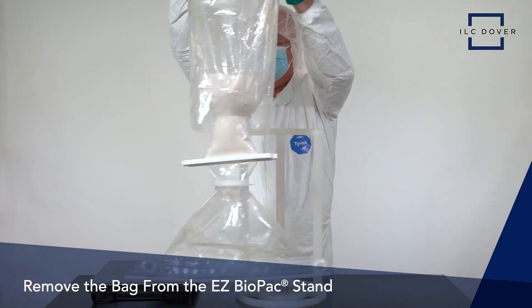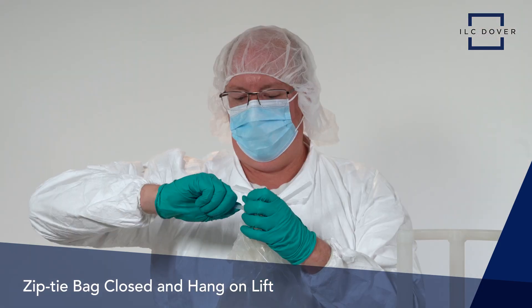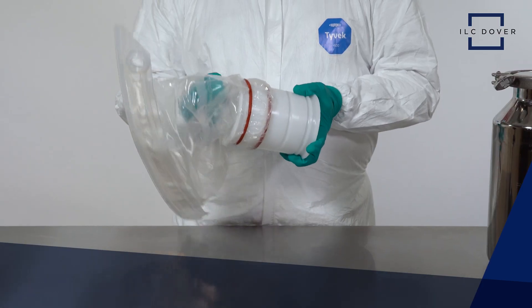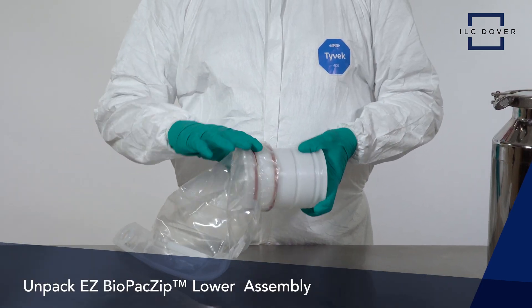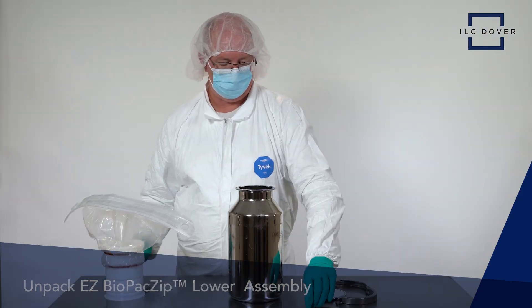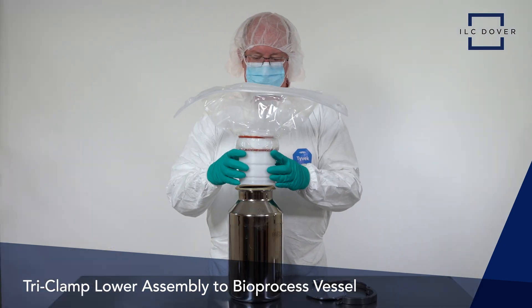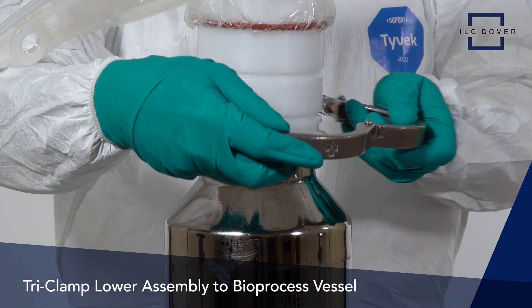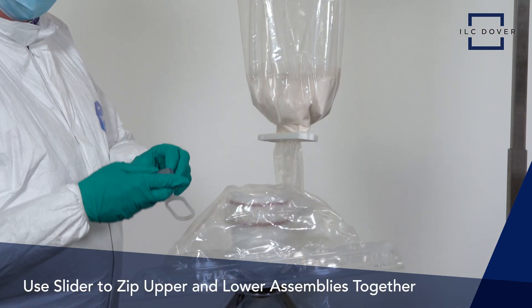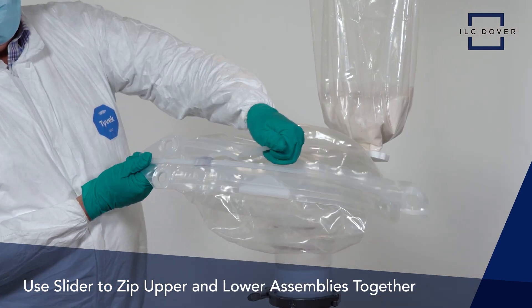Remove the bag from the stand. Use the integrated zip ties to close the bag from the top and hang it on the lift. Now, unpack the EZ Biopack Zip lower assembly, consisting of the zipper integrated on the canister with the O-rings as well as the tri-clamp. Attach the lower integrated assembly to the bioprocess vessel and tri-clamp it together.